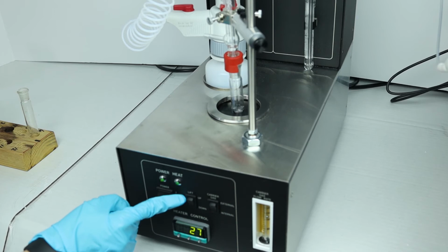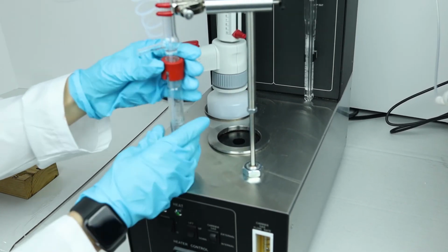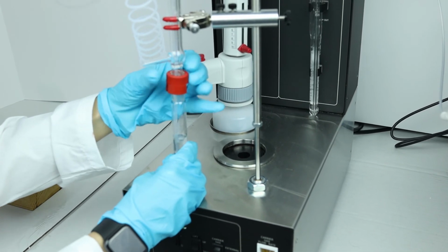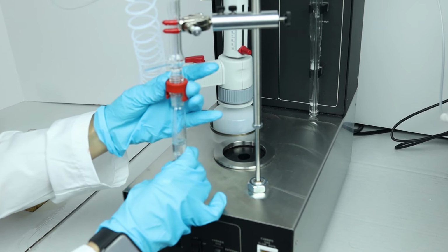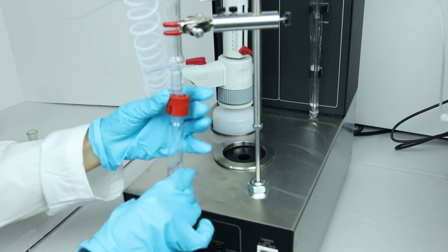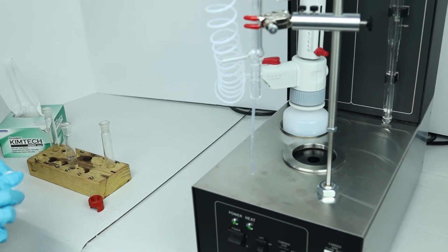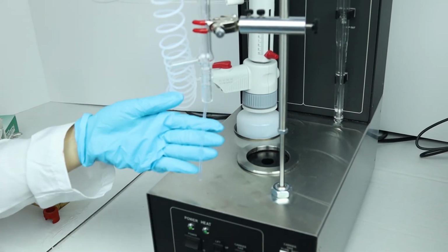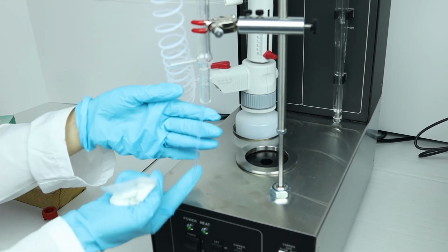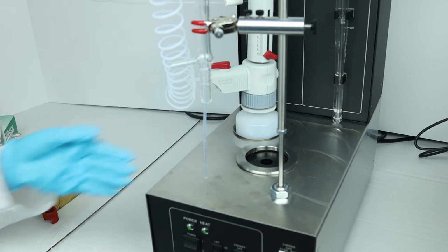To change samples once the blank is finished, press Lift Up, unscrew the red joint connector, and slowly pull the flask down. Use a clean Kim wipe to wipe the tubing from any acid that might be left over on the outside. If you see bubbles of acid on the inside of the tubing, flick the tube a couple times to get rid of the bubbles.